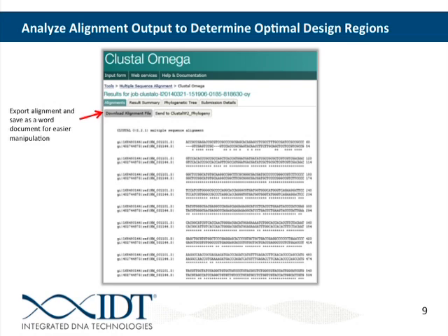And then you can adjust here if you want what kind of output it's going to give you. I typically leave it as Clustal, either with or without numbers, depending on what you prefer to look at. And then you push the submit button. And what happens is Clustal nicely aligns our 2 sequences of interest for us, marks gaps here with these hashed lines, and stars indicate the same base. So wherever we see the lack of this star down here, we know that this region is different between our 2 sequences.